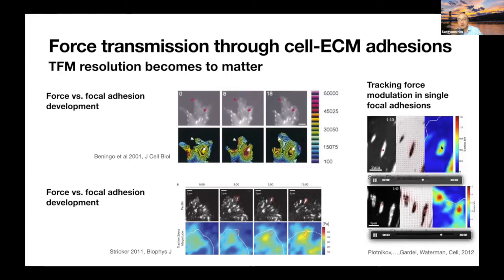They found that when the adhesion is more inside, the focal adhesion, the traction force is more stable, not fluctuating much. But at the edge, the adhesion looks not very fluctuating, but the force becomes more fluctuating. So these authors try to relate this phenomenon to stiffness sensing.